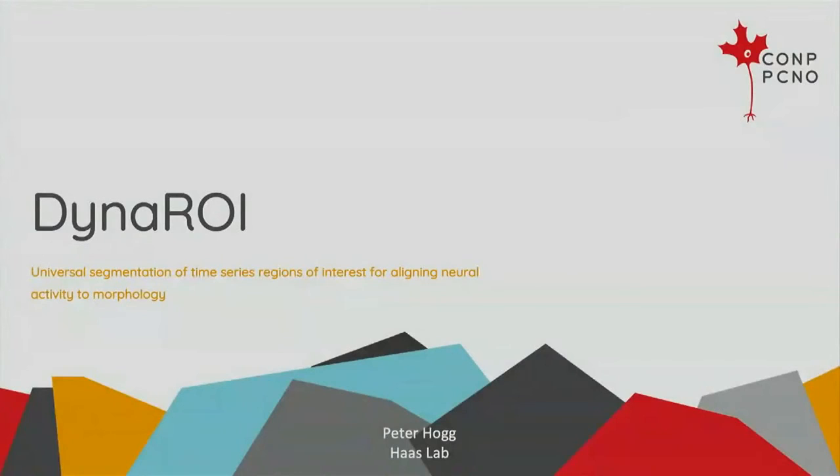Today I'm going to be talking about an open source software project called DynaROI, which is a dynamic region of interest management software that I started developing a few months ago. And the talk's titled Universal Segmentation of Time Series Regions of Interest for Aligning Neural Activity to Morphology.